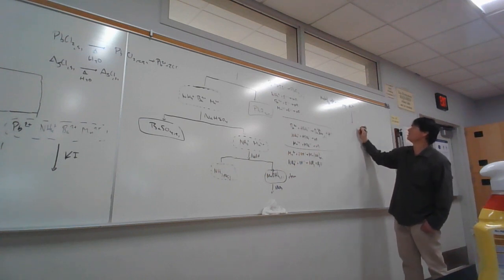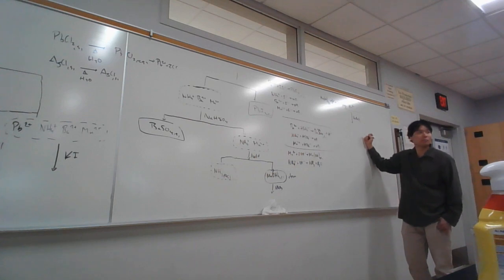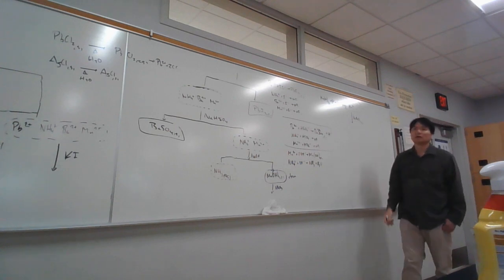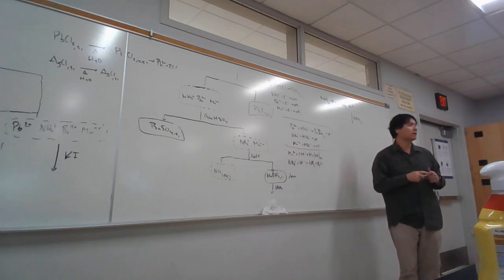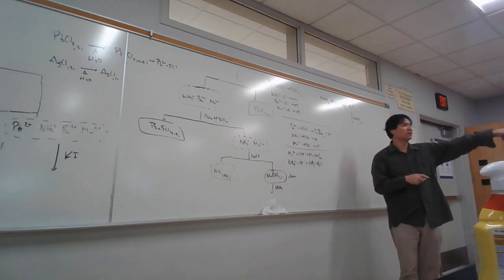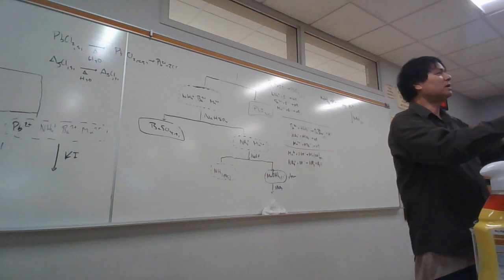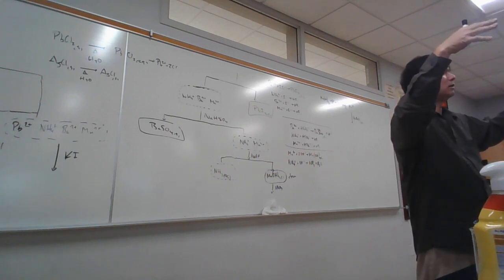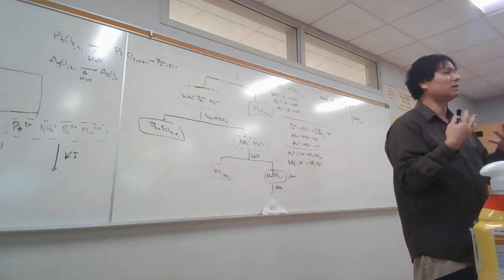Then we add sodium bismutate. Sodium bismutate is what? NaBiO3? Yeah. It's a solid. It's like a powder. It's very hazardous. Next to the filter paper is a bottle of sodium bismutate. The sodium bismutate I'm going to move into the hood. One time I was doing this lab and I looked over there and there's a big brown dust cloud there. And the person was just standing, they didn't even care that they're inhaling sodium bismutate.